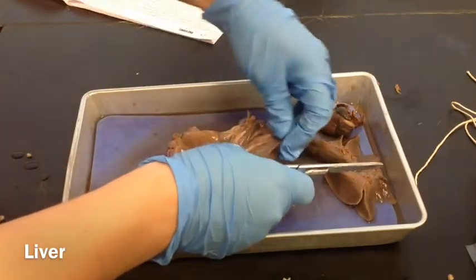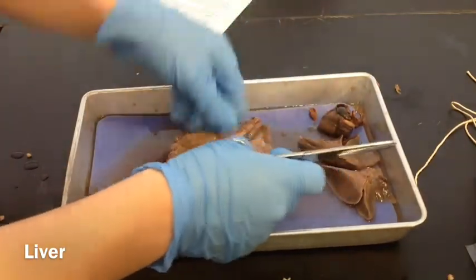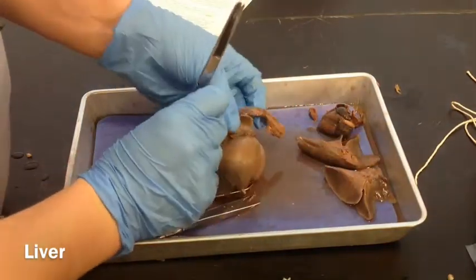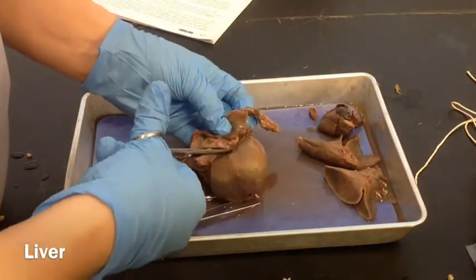This is the esophagus. The esophagus is coming down here, and it's going to go through the diaphragm right down here.